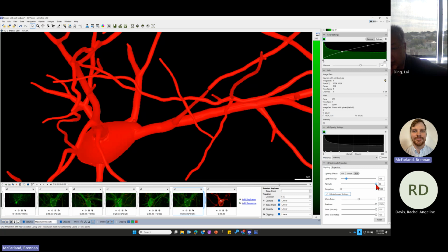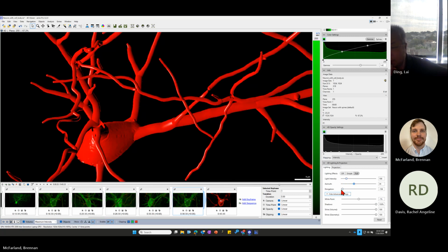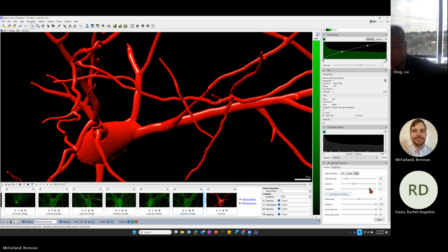I have this up. Okay, now I think we should be able to get something here. Oh, okay. That's a good point.